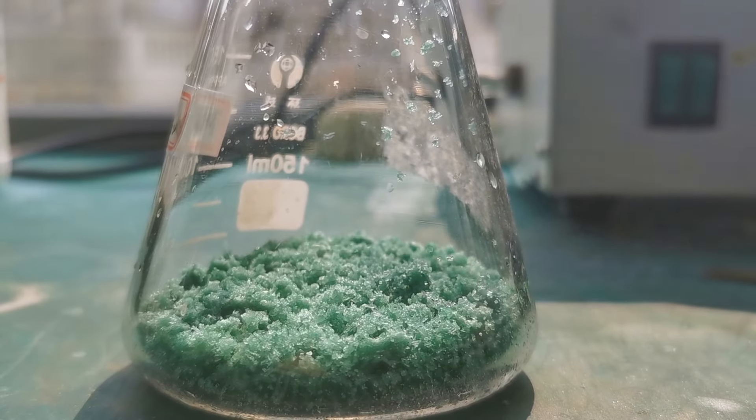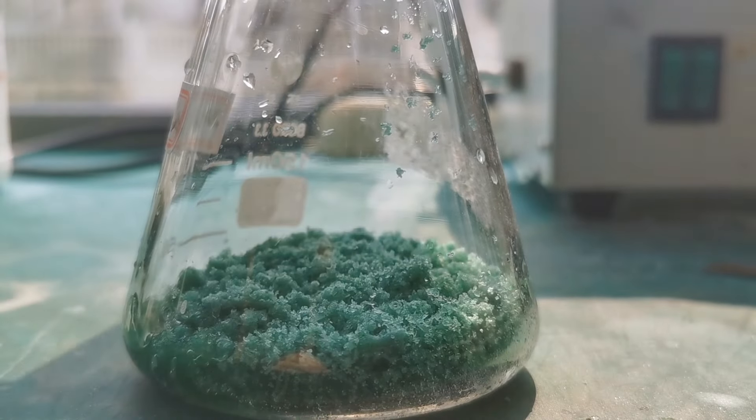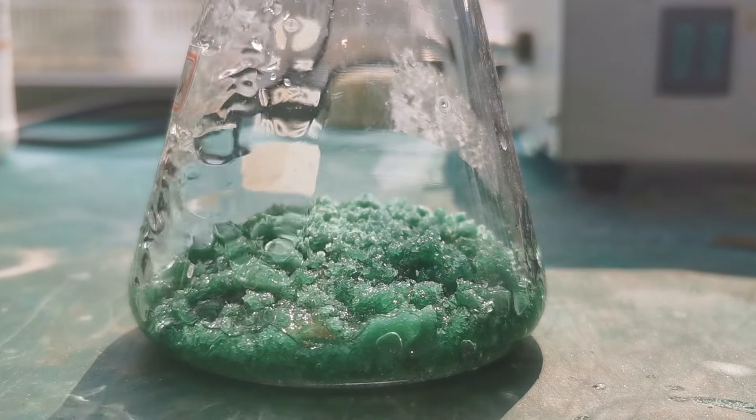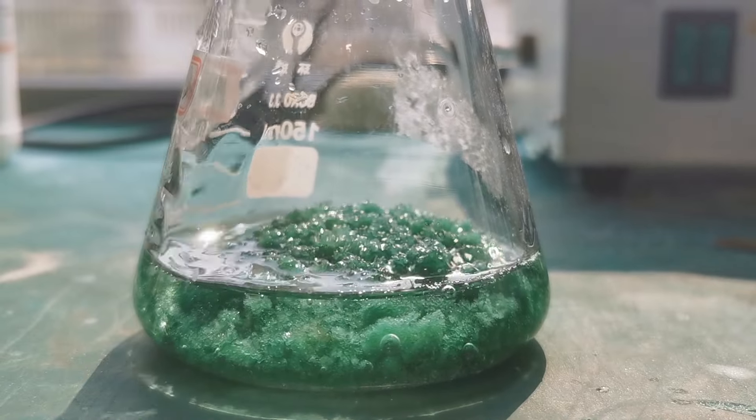To start the plating, I'll make the electrolyte bath first. The recipe of the most commonly used sulfate bath is around 300 grams per liter of nickel sulfate heptahydrate, so I add water to 30 grams of nickel sulfate until the total volume is around 100 mL.